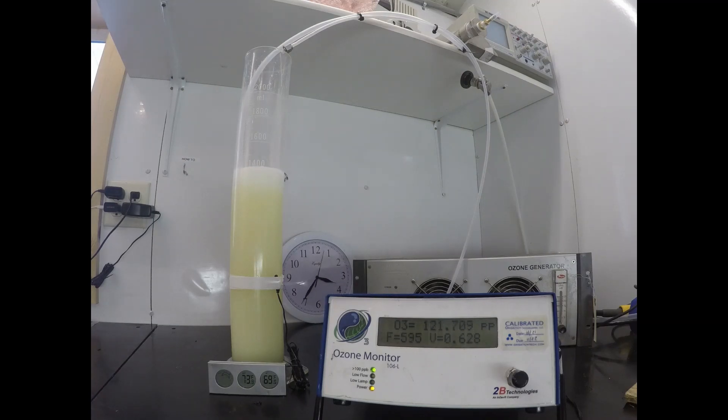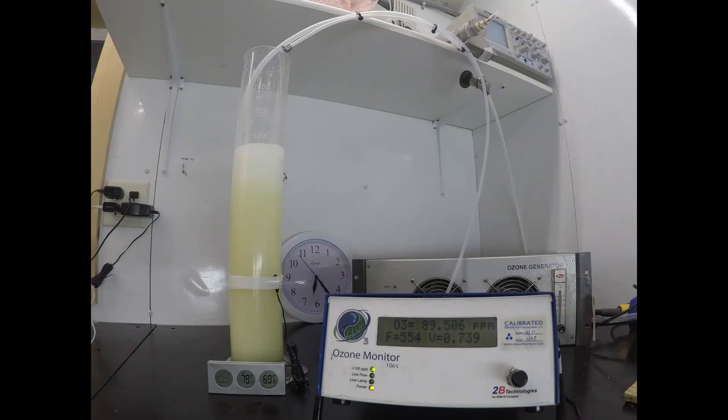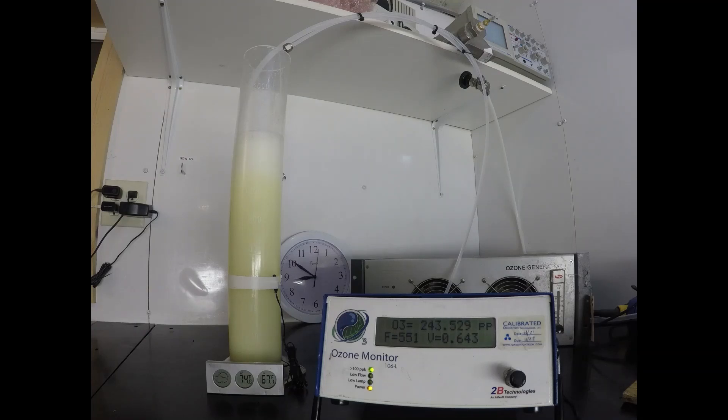What's happening is that air has nitrogen — air is roughly 20% oxygen and 80% nitrogen with a few other inert gases. With that 20/80% mix, the ozone we're creating also produces a bunch of NOx nitrogen oxide byproducts. Those NOx byproducts are entering into the liquid, and that's why you see a little bit of a yellow tinge to it — and that stays, as I'll show you at the end. We believe those byproducts make it a less pure product.